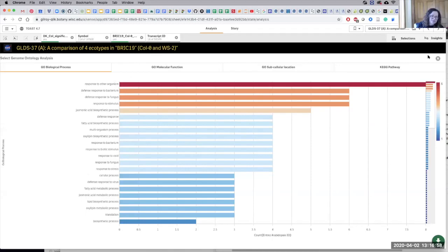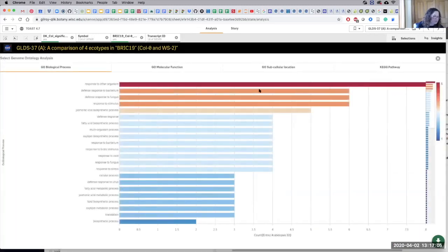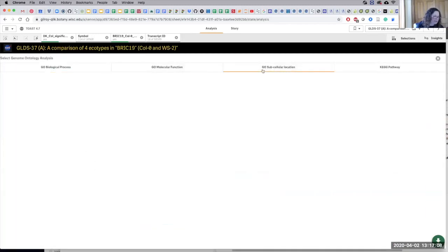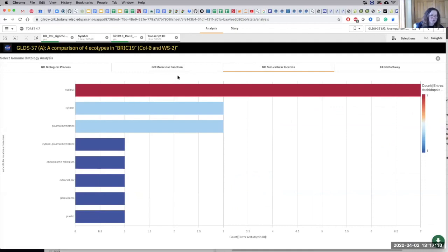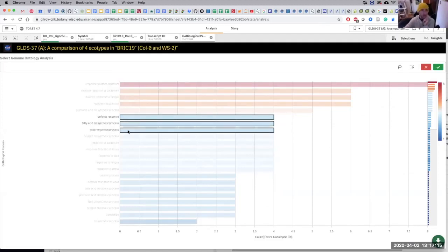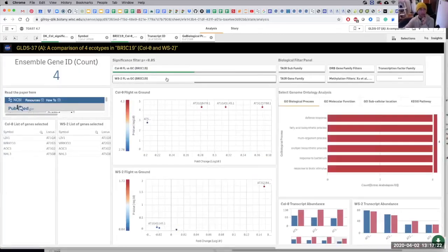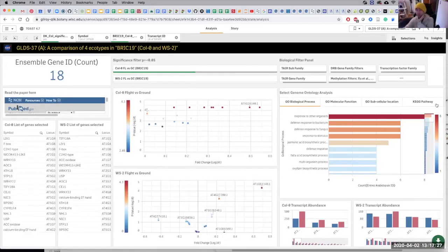Quick question. From this bar graph here, could you select cellular process as a filter and see what those 3 genes are that are involved with cellular process? Oh yeah, totally. You can click on any of these things here and select subsets. To go further, I'm going to press yes. That's a great question. And now that's been applied as another filter. So it depends how small you want to go here, or maybe you should use statistics to select what you do here.